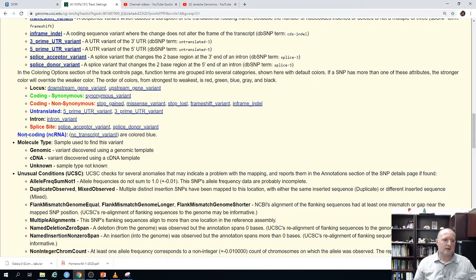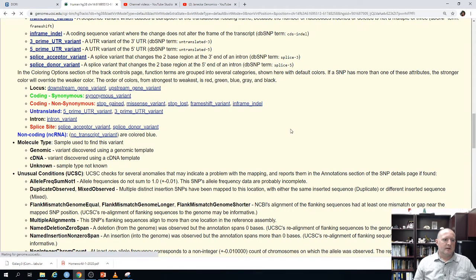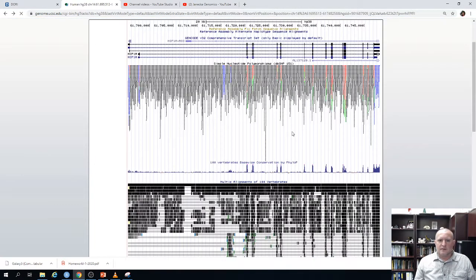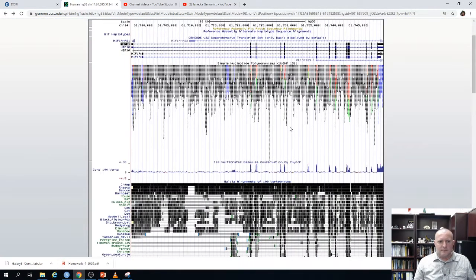Blue can also mean a non-coding RNA, and red can also mean a splice site. They probably should have picked different colors for those, but that is what it is.